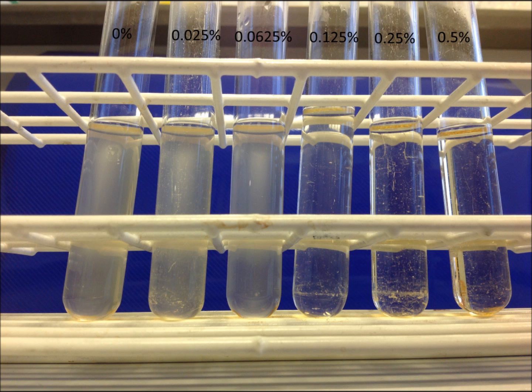This tube tells us how much our inoculum of E. coli can grow in the conditions that we've given it. Now if you look at the tubes you can clearly see that there's growth at 0.025 and at 0.0625% Chloros. You can probably convince yourself that there's growth in the 0.125% tube.